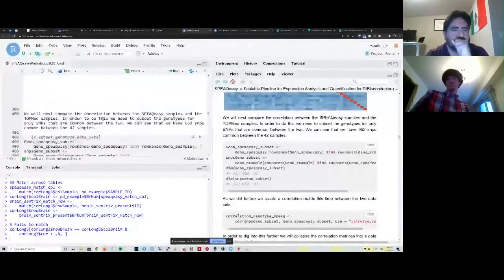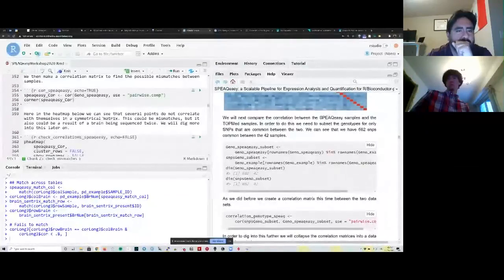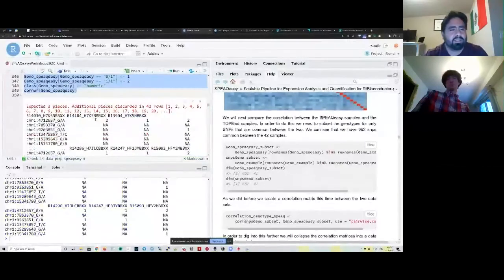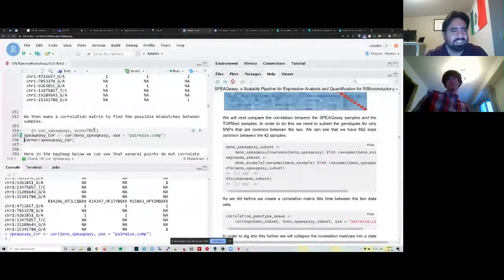Yeah, still an NA, so I probably missed it earlier. Sorry about that. I was trying to run the code interactively, and I forgot a line while talking.